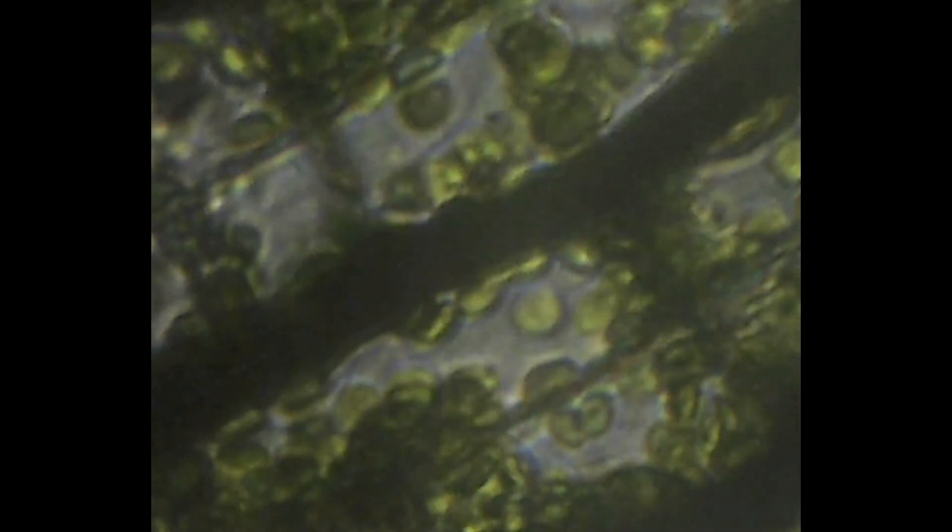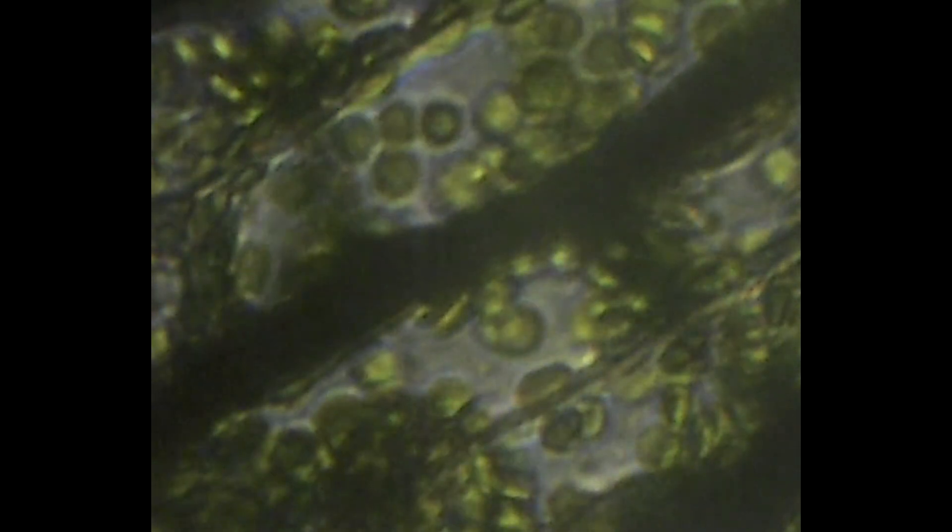It is likely that its function is, at least in part, to speed up the transport of molecules and organelles around the cell. It is usually observed in large plant and animal cells greater than approximately 0.1 millimeters. Hydrilla leaf cells are larger than 0.1 millimeters, so clearly cyclosis can be seen.